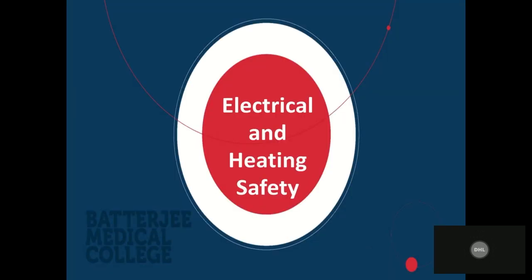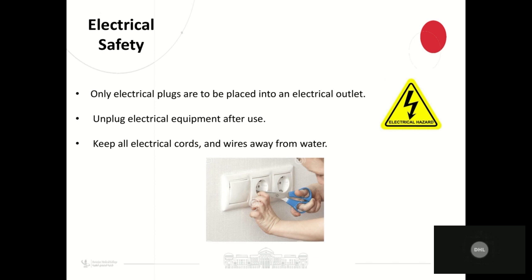Electrical and heating safety. First, we'll talk about electrical safety. Only electrical plugs are to be placed into electrical outlets. When you finish any experiment, like using the microscope, unplug the electrical equipment after use. Keep all the electrical cords or wires away from water for your safety.